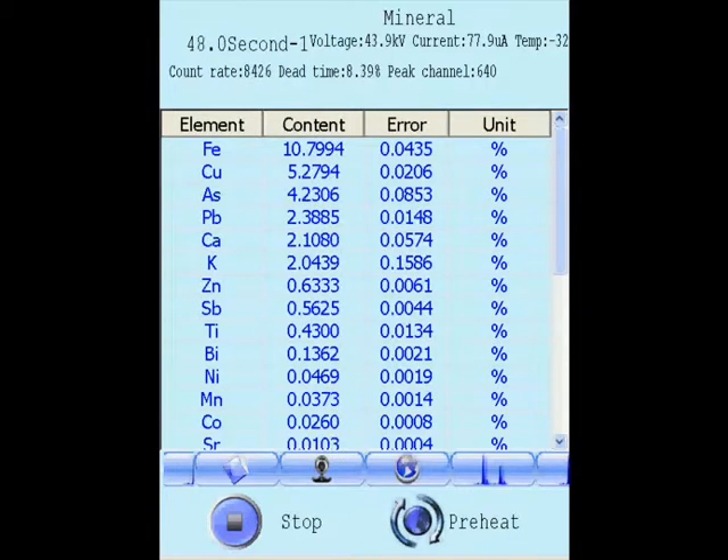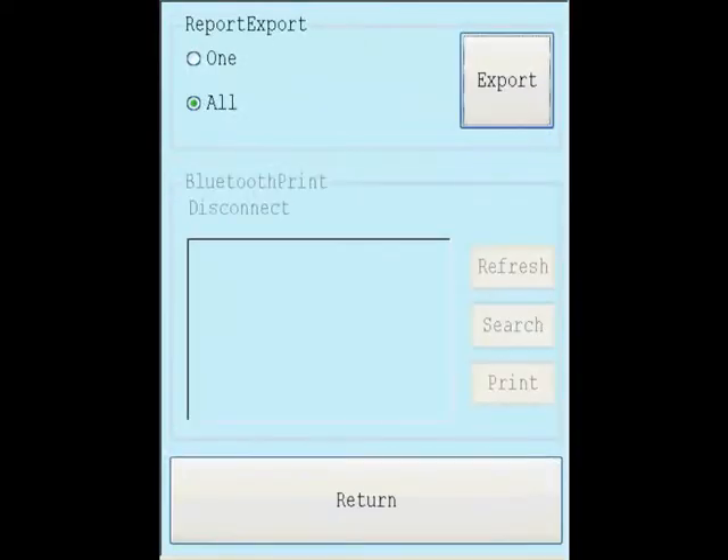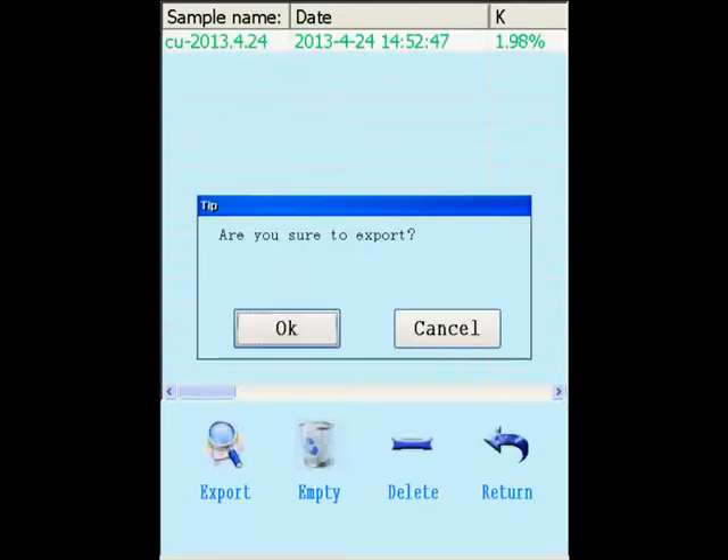Click the rightmost icon to export the report and export history records. Select History Records. Power off the instrument when the test is over.